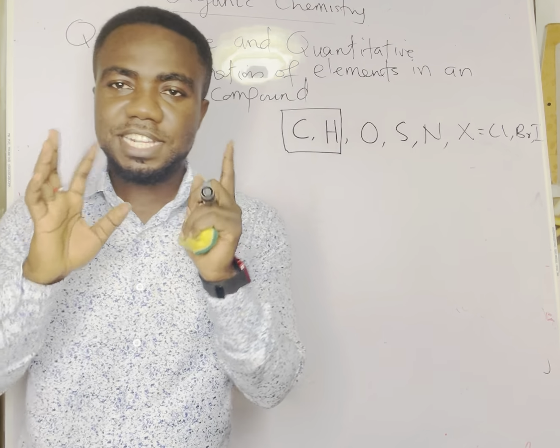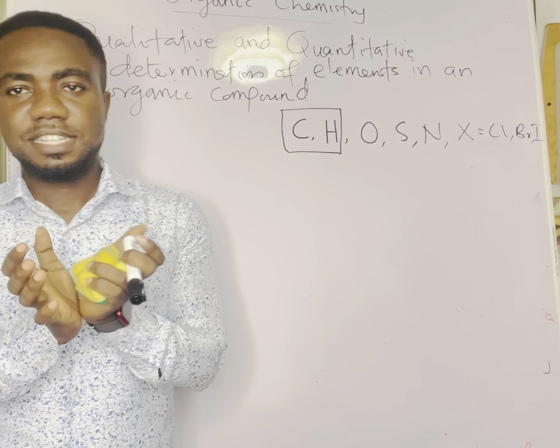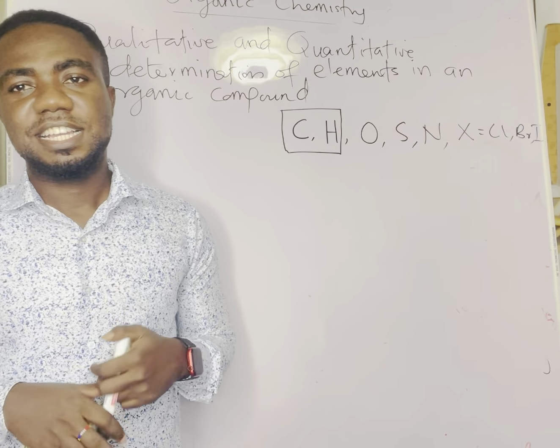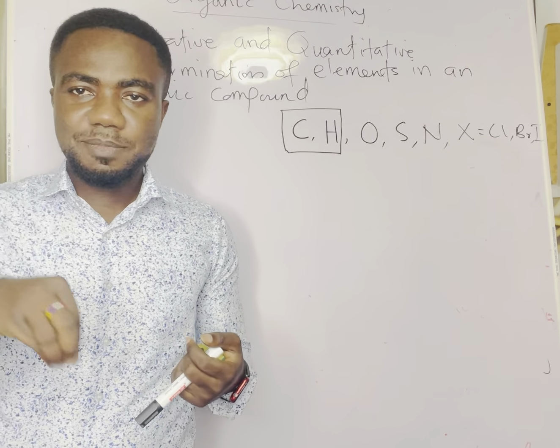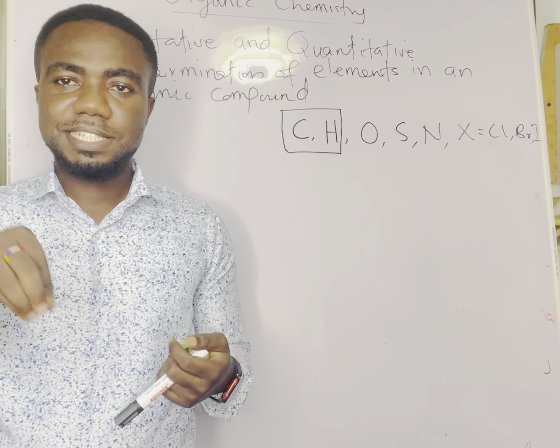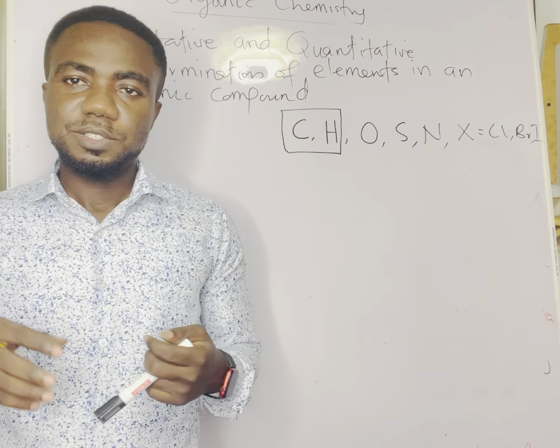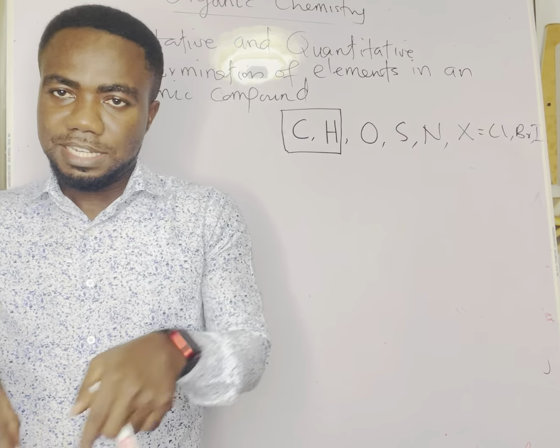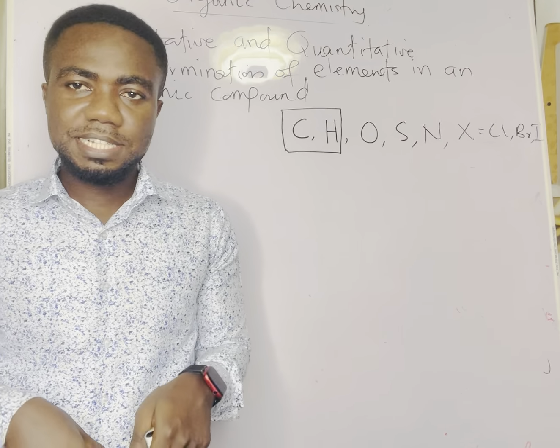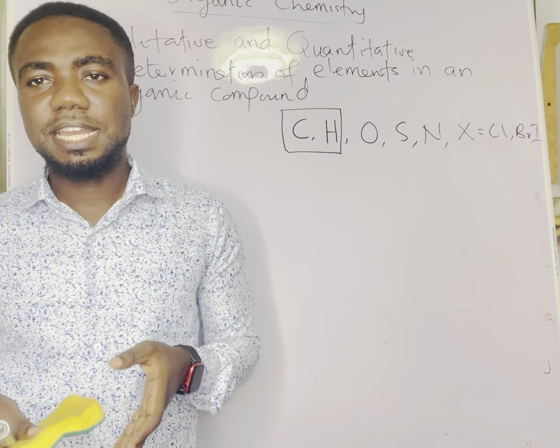When you are given an organic sample, say X, and you are asked to determine the particular element present in the organic sample, the procedure used to get the particular element present is what we determine as the qualitative analysis.